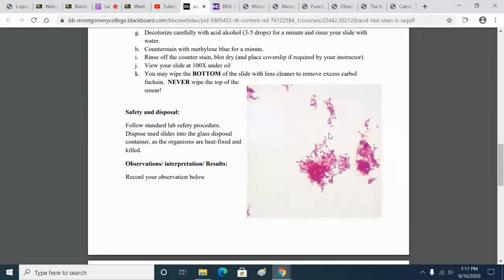You should never see anything that's acid-fast positive in a sputum smear. Everything should be blue. Epithelial cells in the mucus, any miscellaneous bacteria in the mucus, everything should be blue, right, from the lungs. You never want to see anything that's fuchsia color, because that's bad.